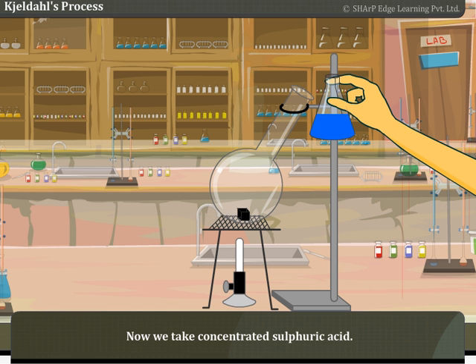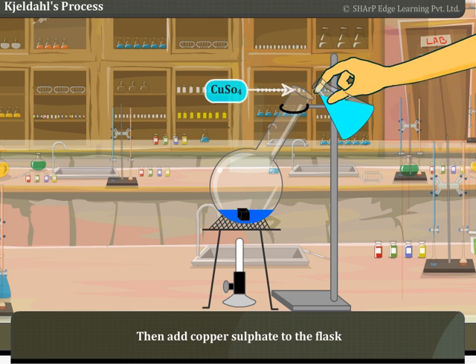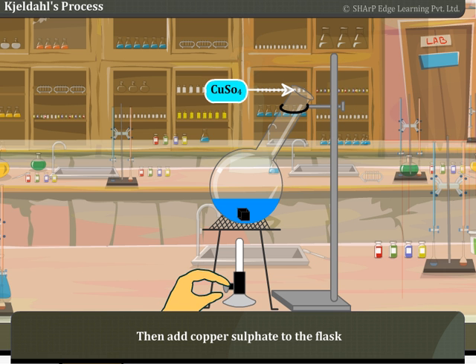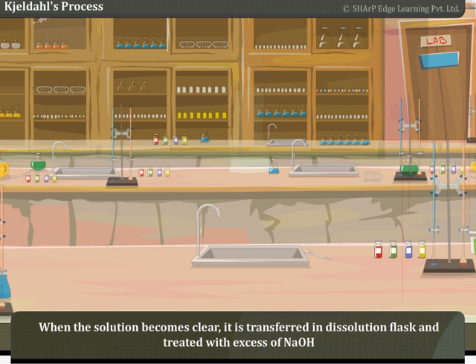Now, we take concentrated sulfuric acid, then add copper sulfate to the flask. We heat this until we get a clear solution.